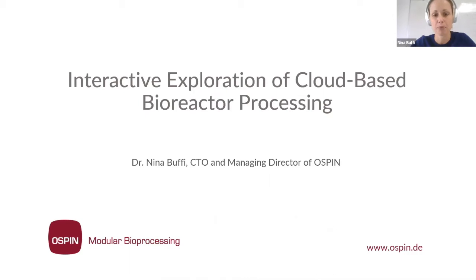The first part of the presentation is going to be a bit normal, in the sense that I will show a few slides where I talk about how a control system for cultured meat should, in my opinion, look. The second part is going to be more interactive and, I hope, a bit more fun, in the sense that I'm going to show you our control system and we are going to program a bioprocess together, and you will also be able to give me feedback and program something with me.